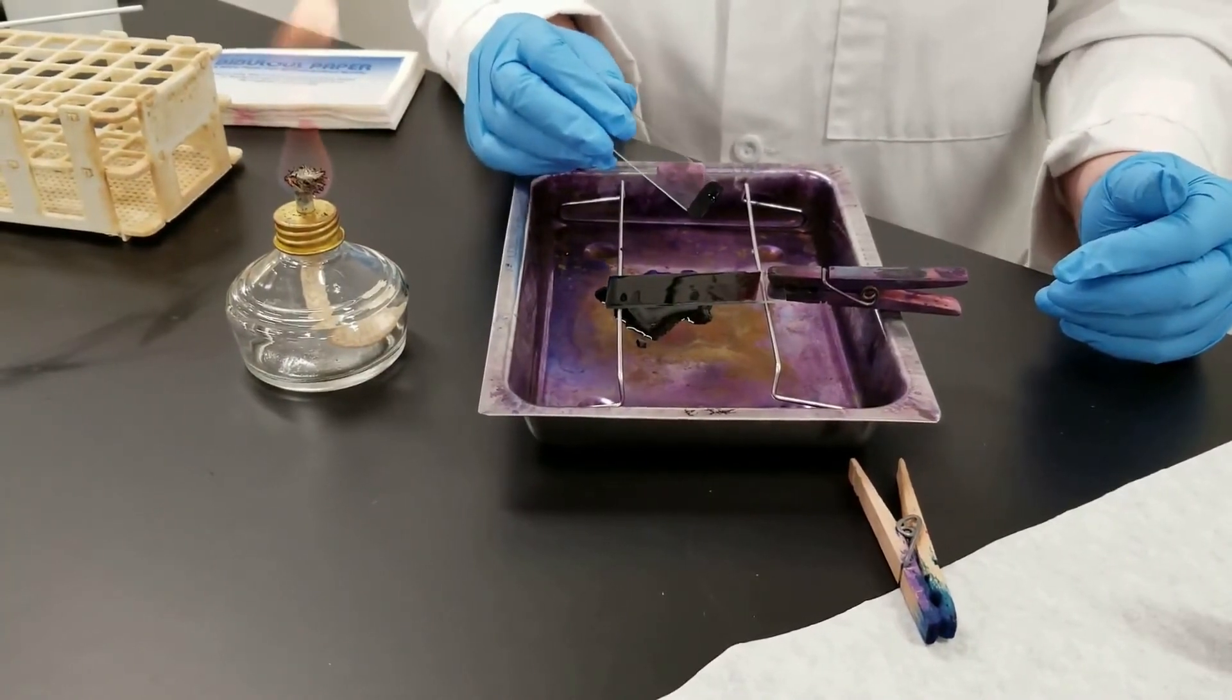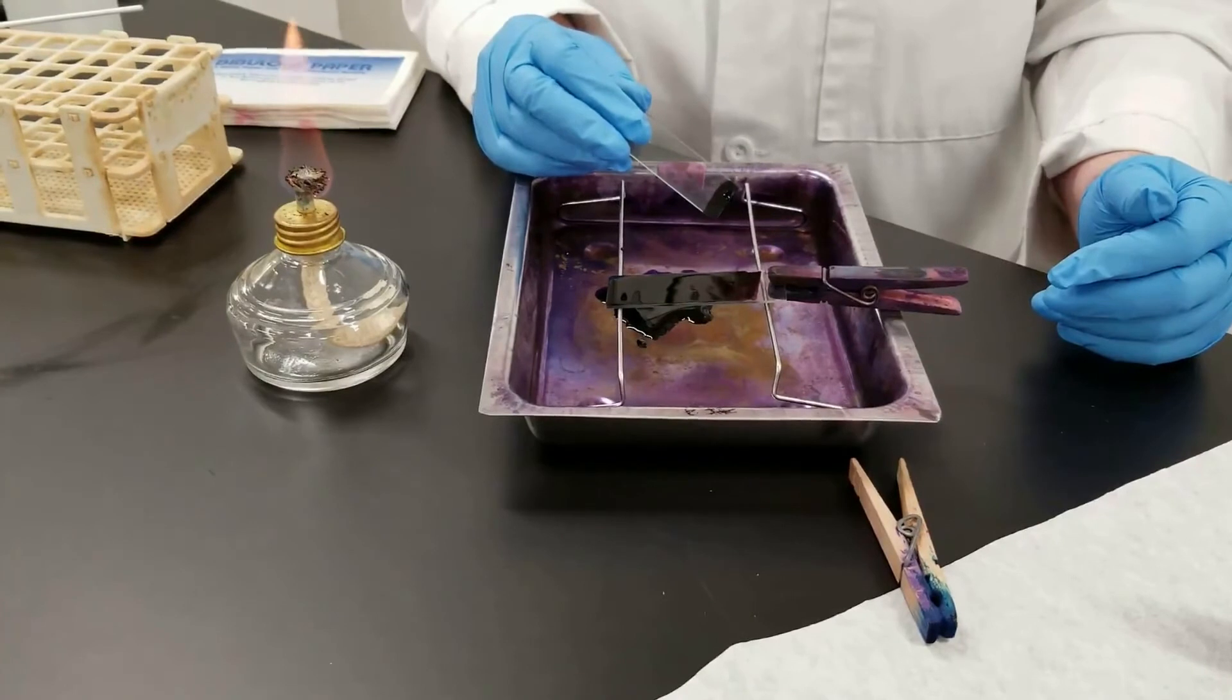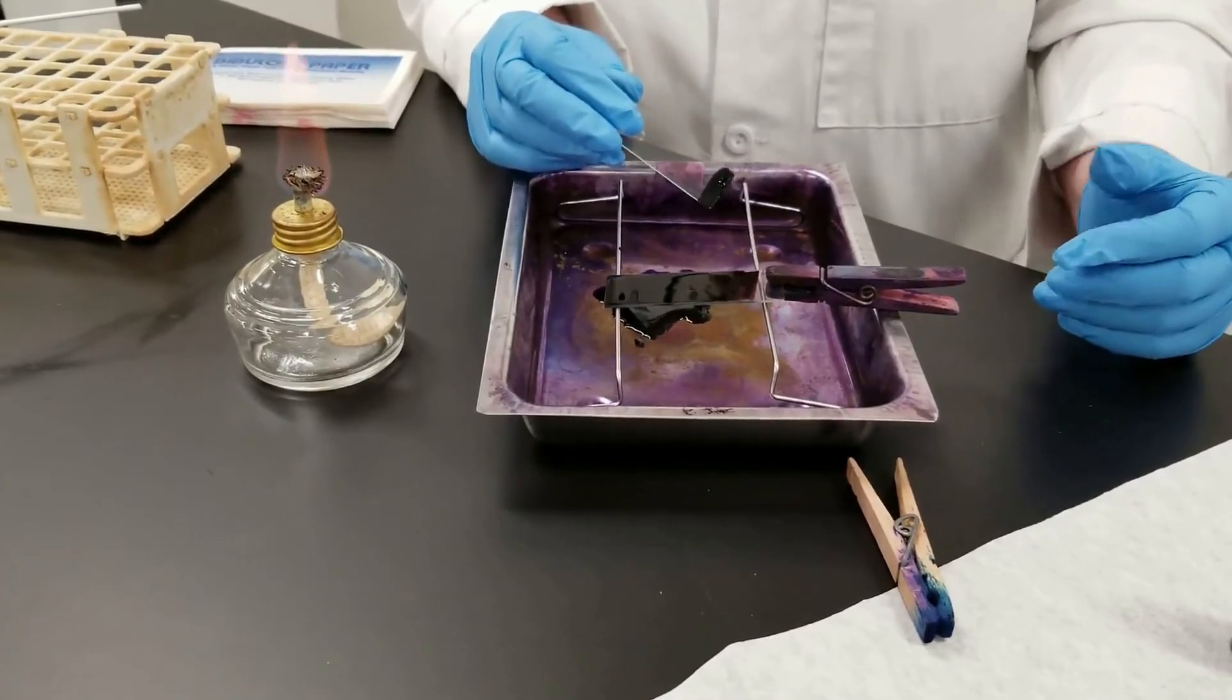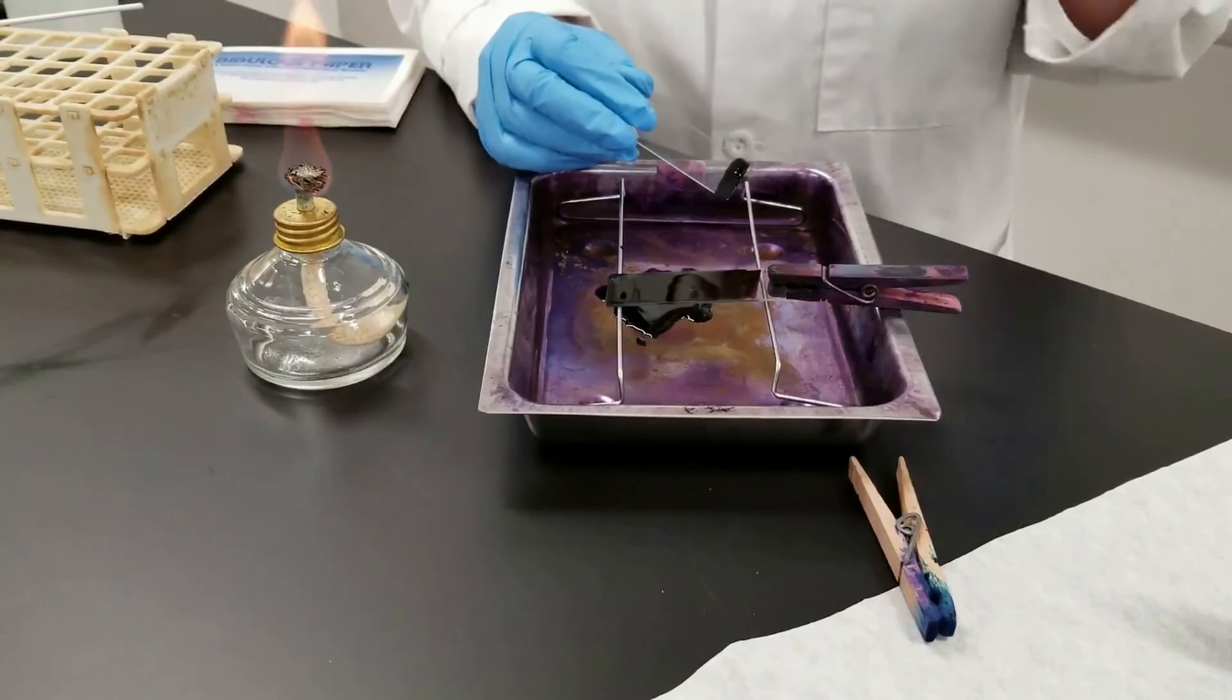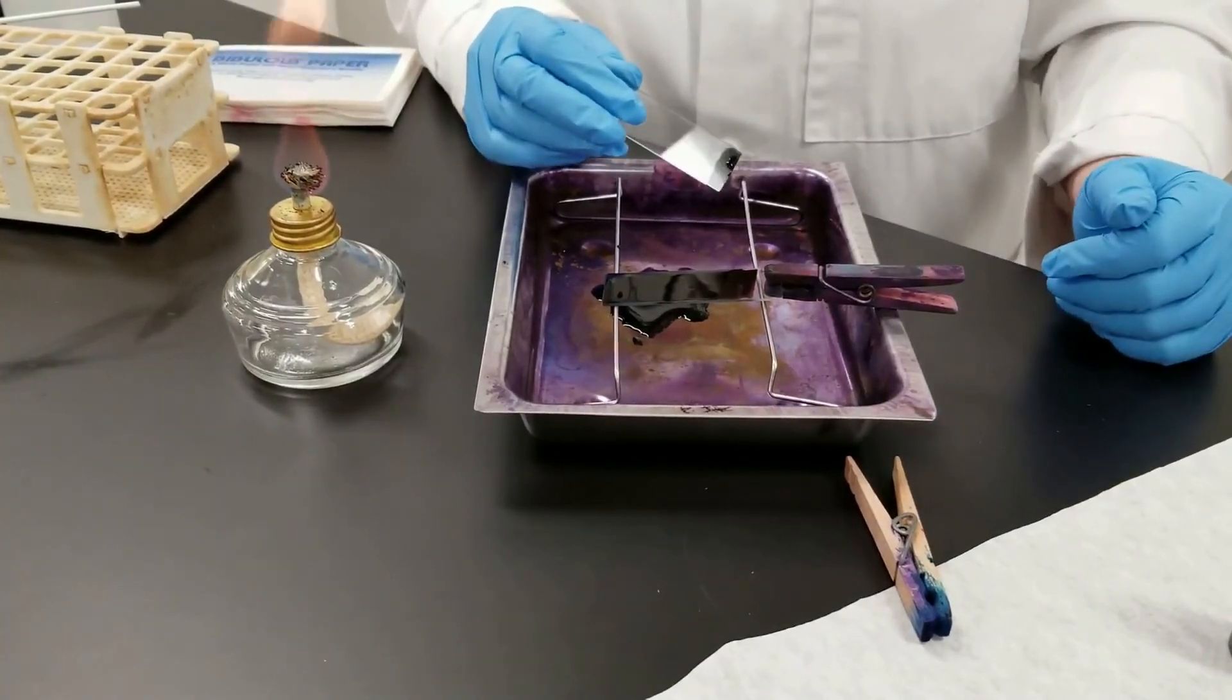Once it has air dried, then we will look at it under the scope. The background will be black and the bacteria will be clear or colorless along that background.